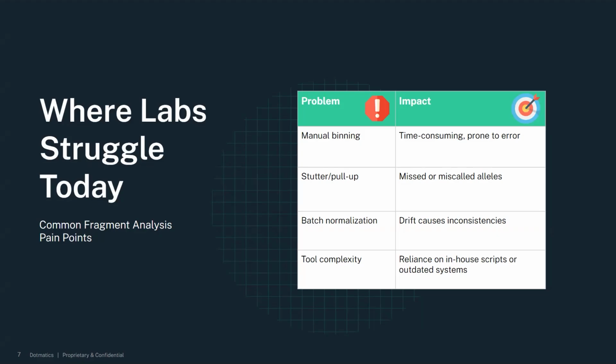Manual binning is essential for AFLP and early microsatellite studies, ranging from microbe diversity and epidemiology to etiology. While some STRs have simple sequence repeats and consistent stutter artifacts, other STRs have complex sequence repeats that result in LUS, or longest uninterrupted sequence, that requires more specific stutter filtering than traditional analysis methods.